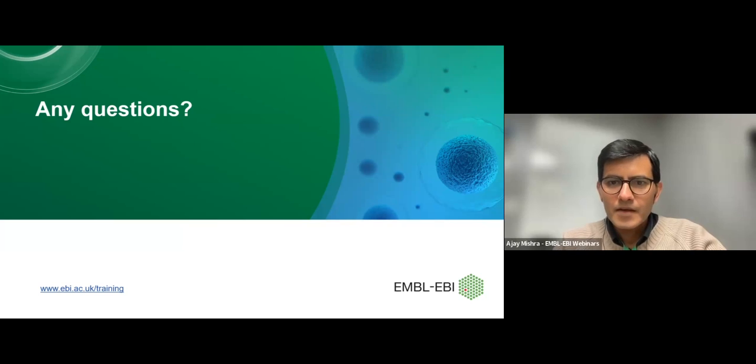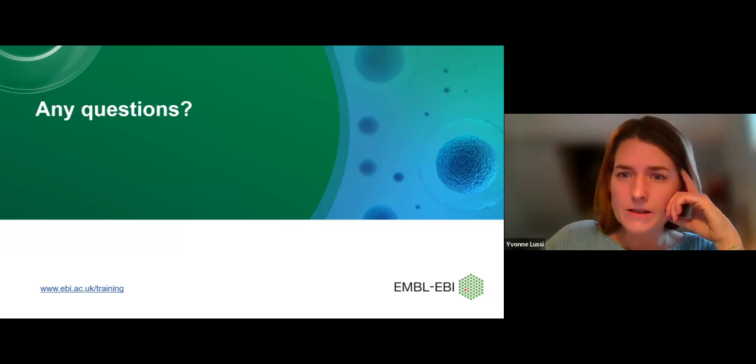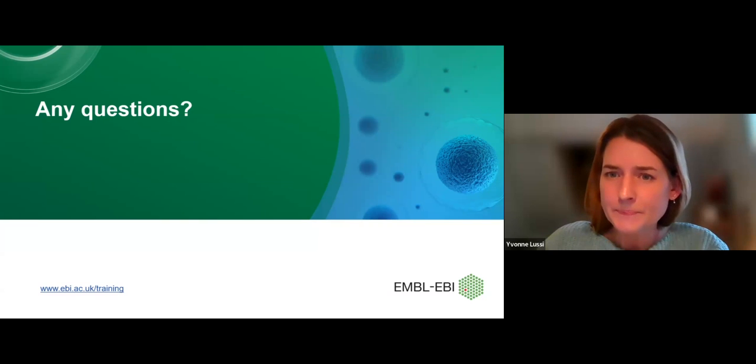Next question is, can we do the same with viral proteins? Is there any specific database for this? You can use this with viral proteins as well, BLAST and Align. Yes, it's for all the species.